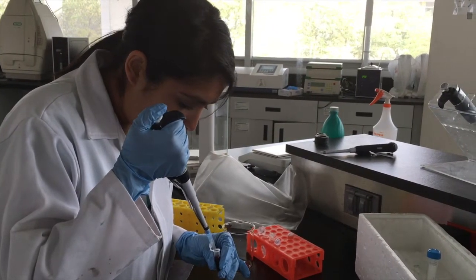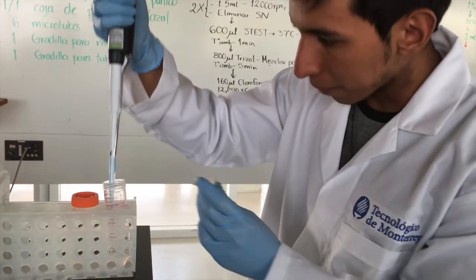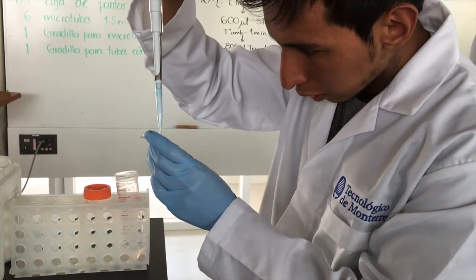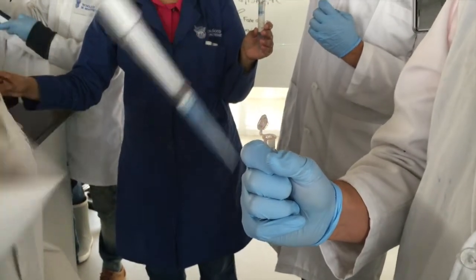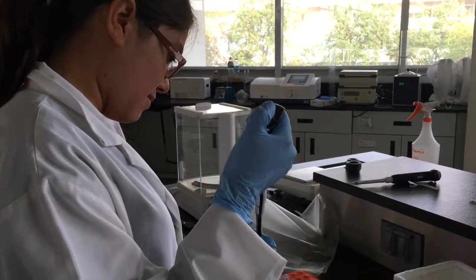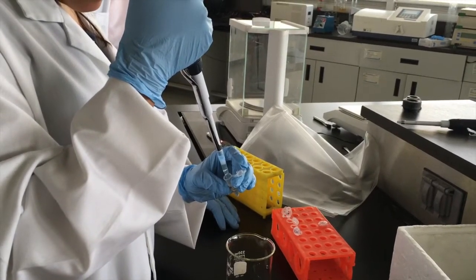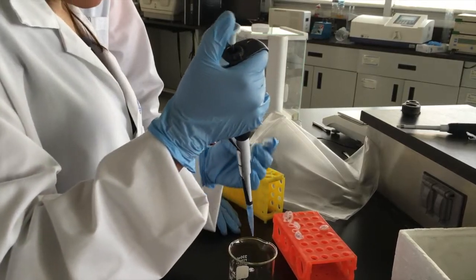2 different kinds of nucleic acids were obtained from a human and a bacterial sample. To purify the DNA, the cell lysis was carried out with sodium acetate, SDS, and proteinase K, while lysis buffer and TRIzol were used to disrupt the bacterial cells. The main difference in the methodologies was the reagents used to eliminate the proteins. To extract DNA, a phenol-chloroform-isoamyl alcohol solution was used in order to solubilize DNA and RNA in the aqueous phase and separate the proteins in the organic phase.